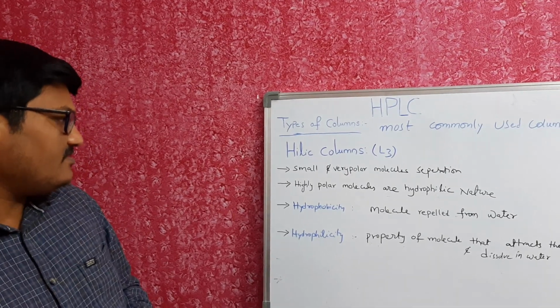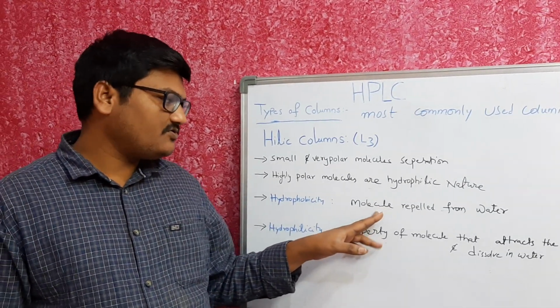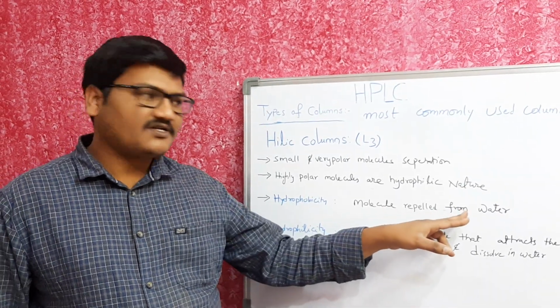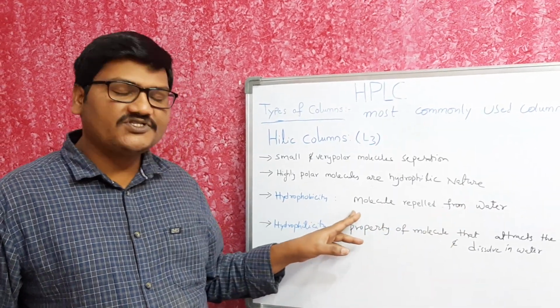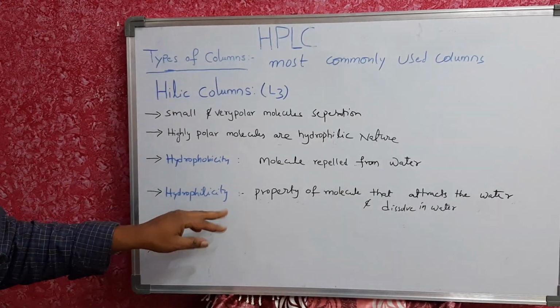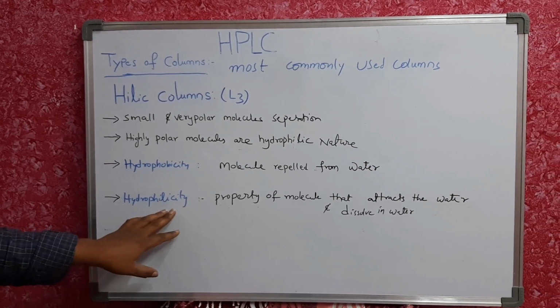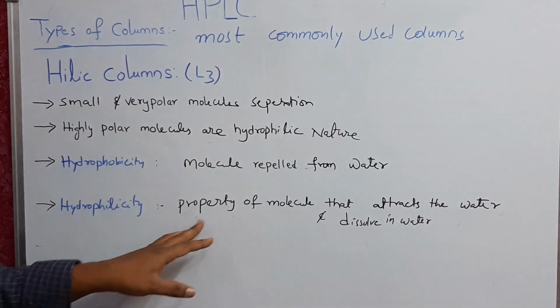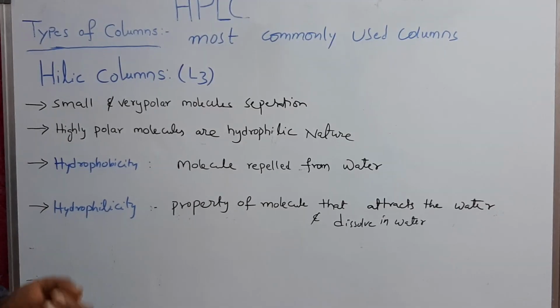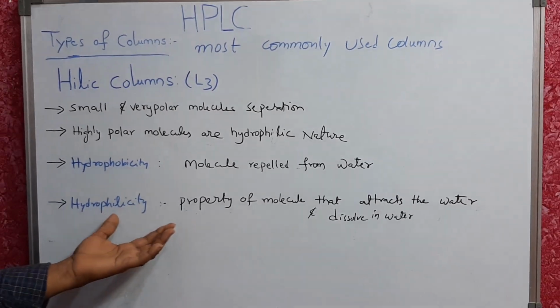Hydrophobicity is a physical property of a molecule which is repelled from water. And hydrophilicity is the property of a molecule that attracts water and tends to dissolve in water.